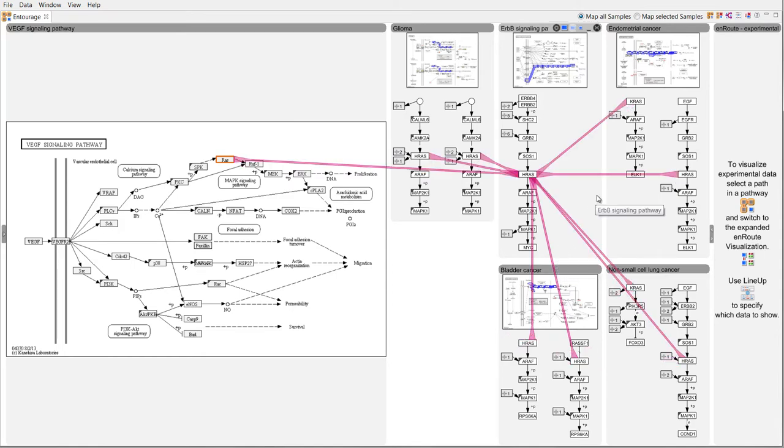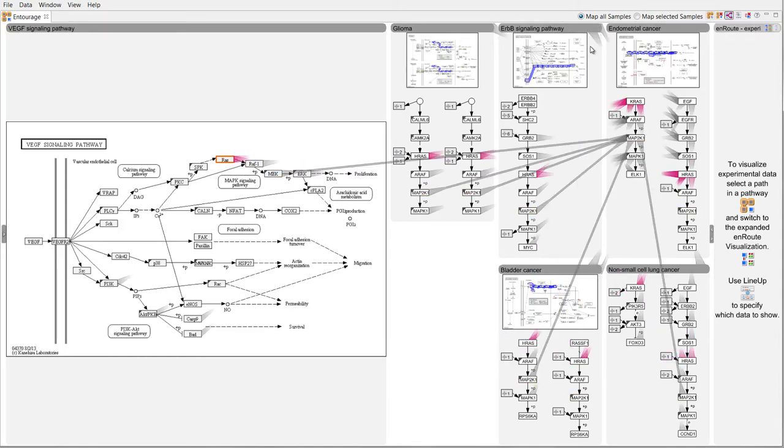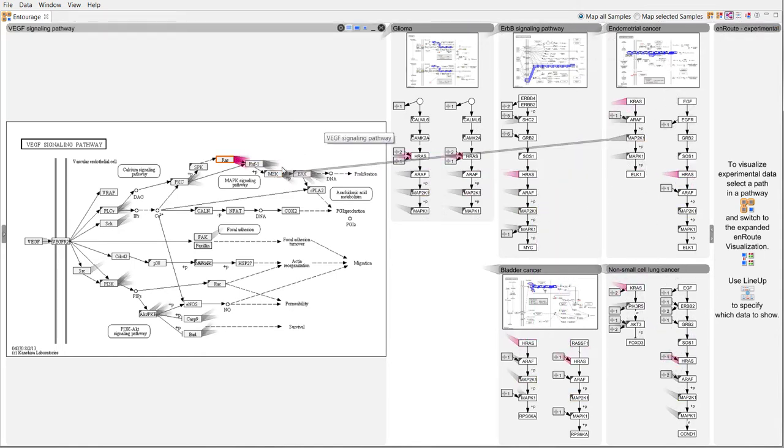To see which nodes play a role in multiple pathways we can switch on stops for all nodes.